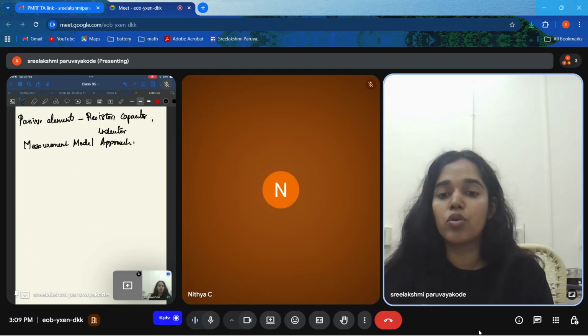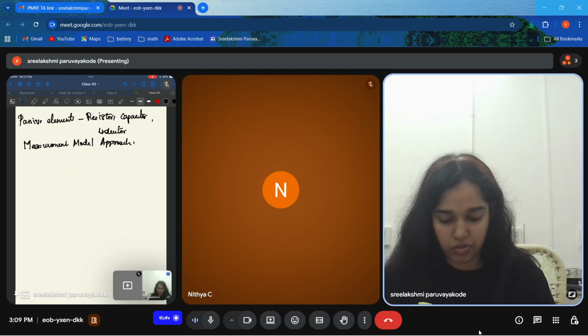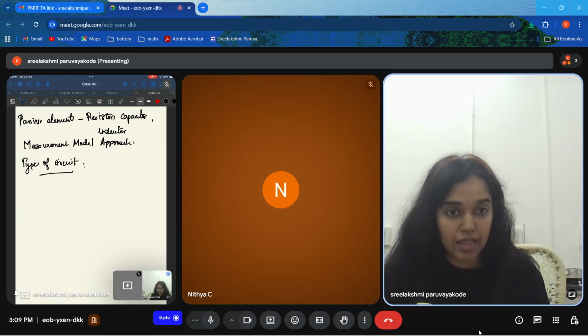Then we will see the types of circuit. I'll be introducing the types of circuit before itself, so it becomes easy for everyone, and then we'll move on with the other topics.